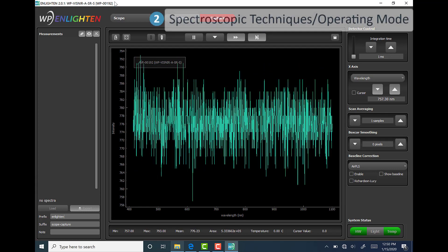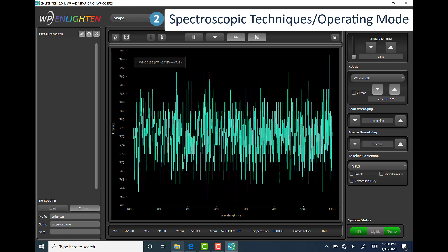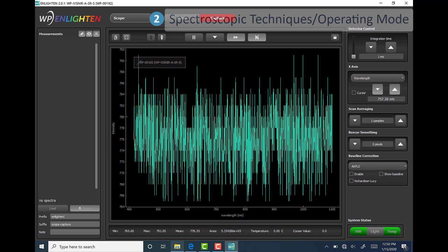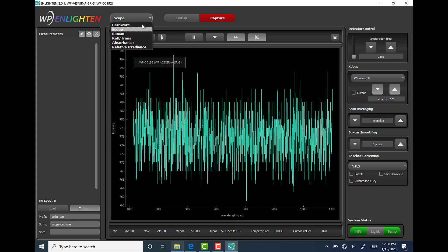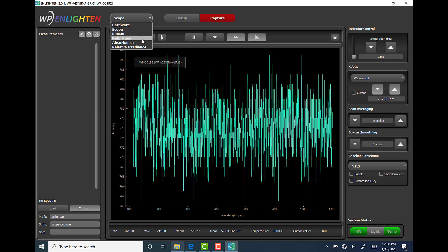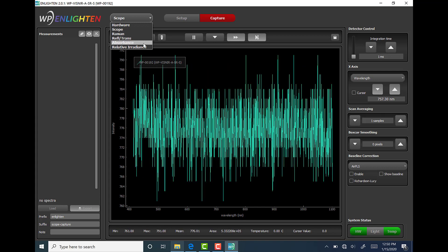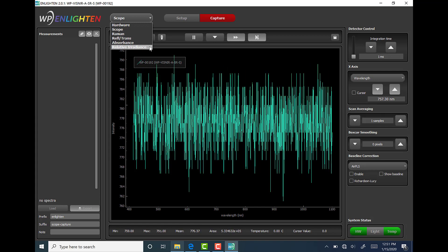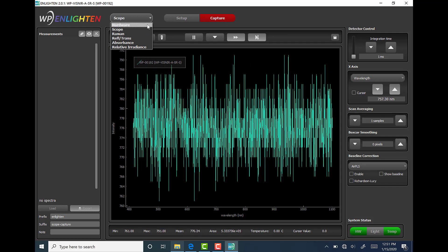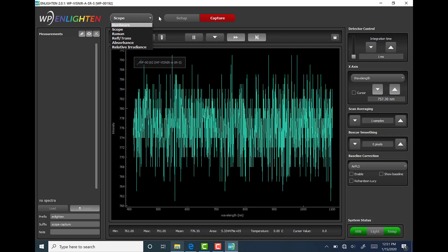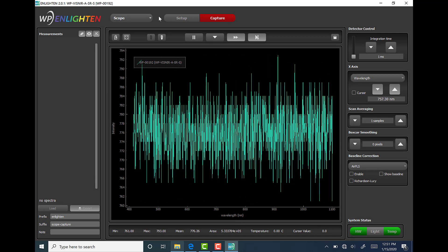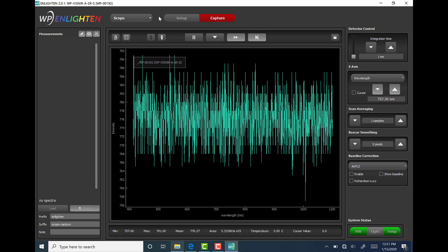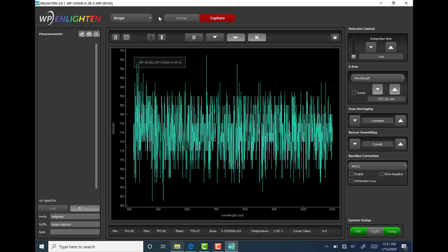Next is Spectroscopic Techniques slash Operating Modes pull down menu. The options for spectroscopic techniques include Raman, reflectance slash transmission, absorbance, and relative irradiance. The only non-spectroscopic option, which we refer to as operating mode, is called Hardware. The details and mechanics of each spectroscopic technique and the hardware operating mode will be described in more detail in future videos.